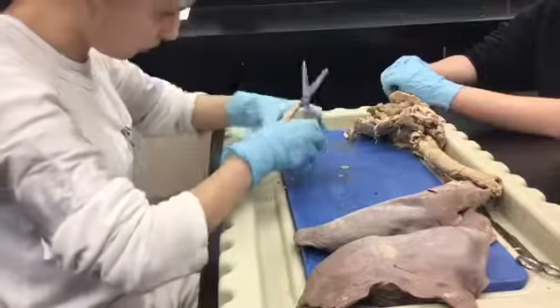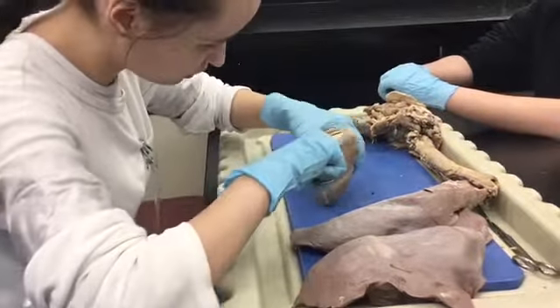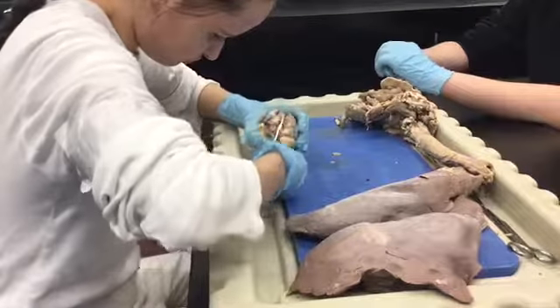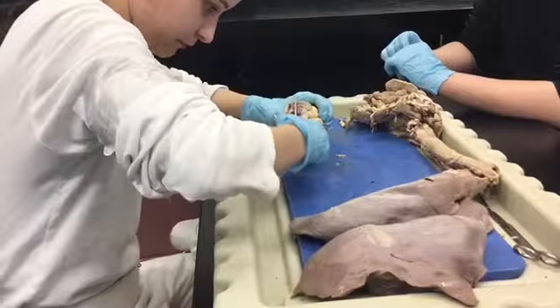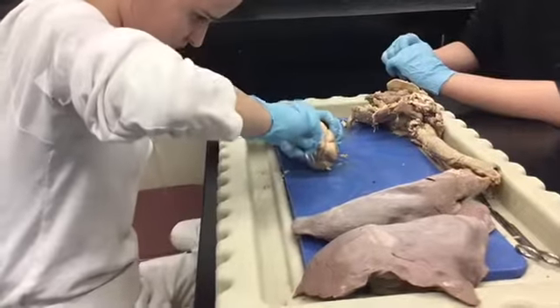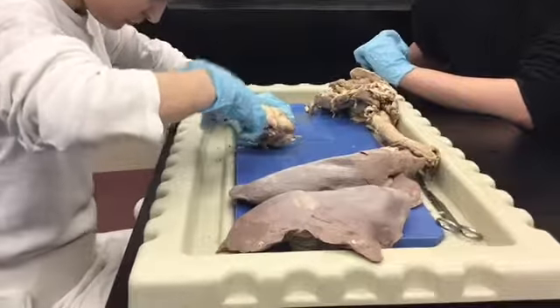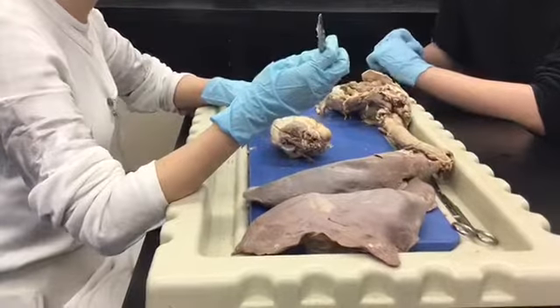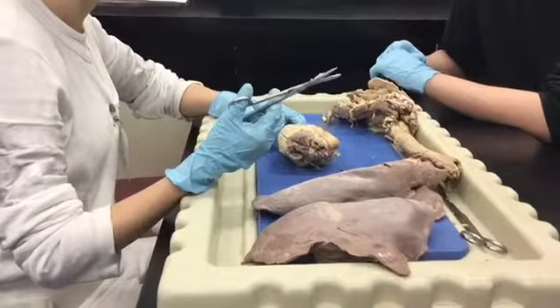It'd be different if I had a scalpel, but I don't have a scalpel. We use those at Johnson's for us. Oh, look at all this fat. I wish I had a scalpel. Our scalpels don't fit all the way through, so it tends to be very jagged. So I found while this is harder, you get better results with the scissors. Oh, okay. Yeah, that's definitely.